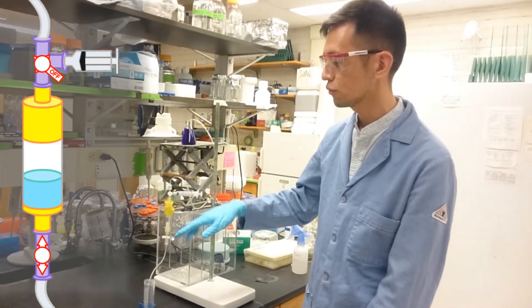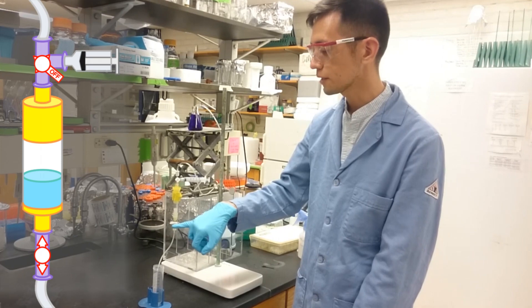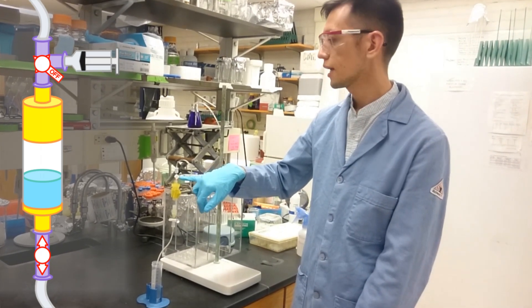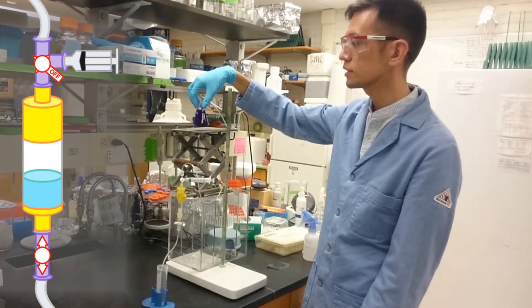In this setup you have your protein column, and inside I have just glass beads to stand in place with the resin. You have a stopcock at the bottom, and a three-way valve at the top. Up here is tubing connecting the three-way valve to the solvent reservoir where your buffer is.